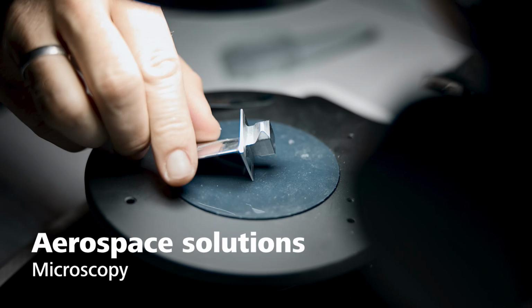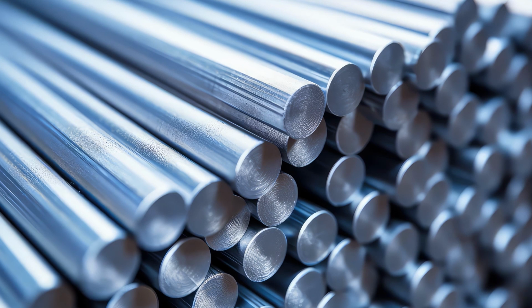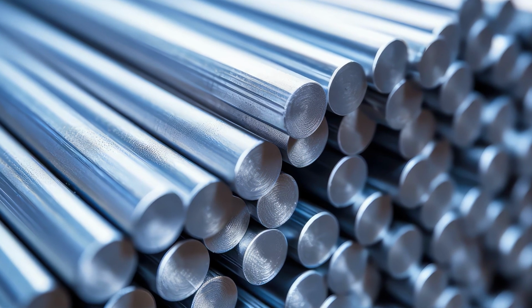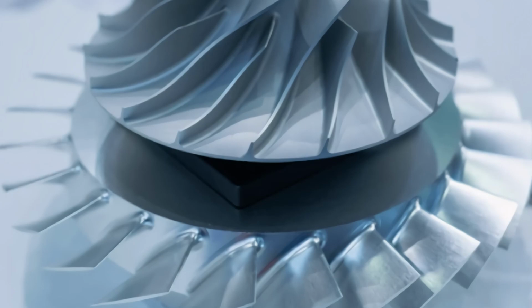What we're going to do now is touch on some of the topics. We'll talk about grain sizing, coating thickness, multi-modal microscopy, and how this can benefit you if you're using or requiring multiple methods for analysis. So say, for example, you need to check the quality of the incoming material for your goods and also the finished product.